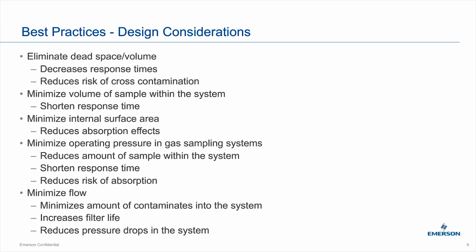Also, if you do have these dead spaces, it's possible, whether it's a liquid or a gas, to get into them. And then when you switch samples, you can actually cause some contamination because now you have to find a way to get that old gas out of there or to purge it. And many times you can't. So the best practice is to eliminate them as much as possible.